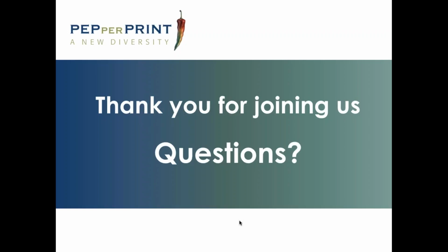Well, it would take around 1 month. Mm-hmm. This month, so here's Silke, also from the headquarters in Heidelberg. This month includes also quality control steps, and then the chips are ready for sending, or customers can send us a sample, and we do the staining and analysis.